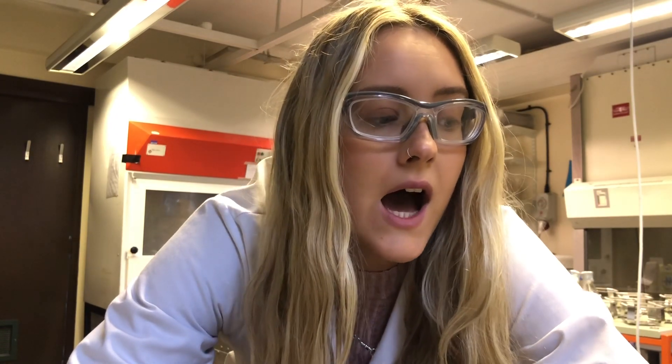Happy Friday! I'm feeling good today. It's been a good week actually. It was really nice having that weekend away last weekend because I feel like I've come back a bit more refreshed and motivated and ready to go again, and I feel like I have my life under control. Today I'll get the results from my first plate, my 24-hour plate, and just from looking at them after taking them out of the oven, they look so good! I'm gonna go and stain them now with my crystal violet stain and see how they look once they're purple.